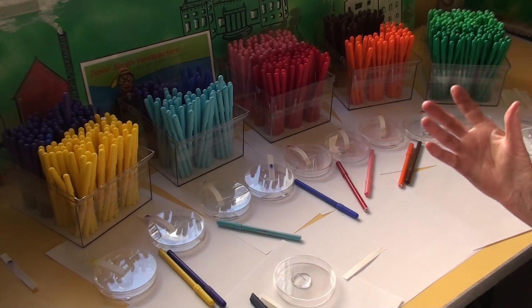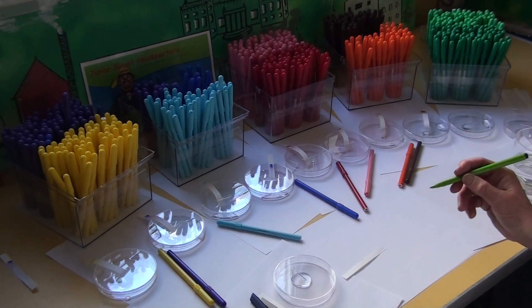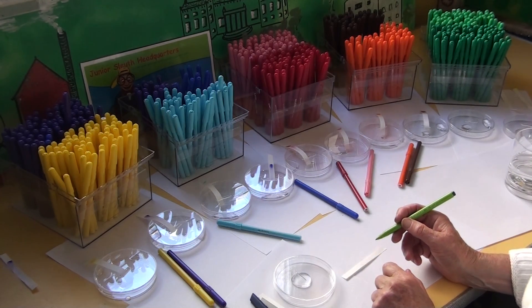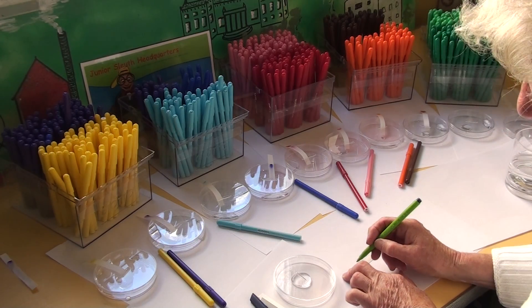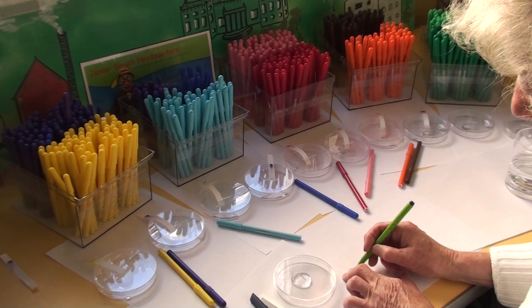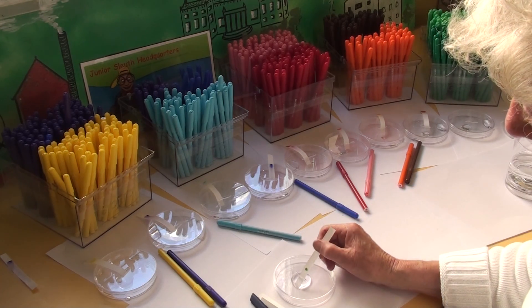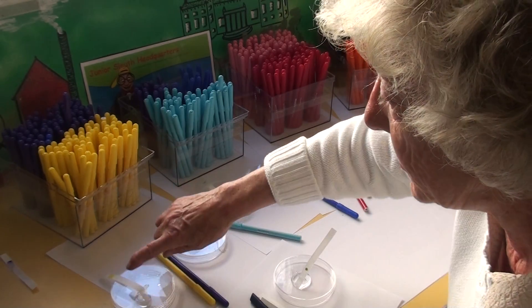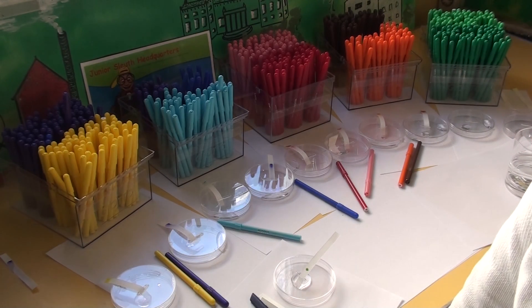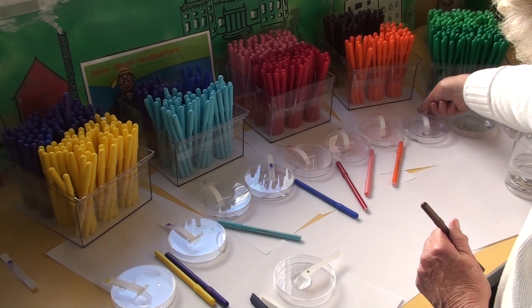Each child gets a strip of chromatography paper. They will have chosen one of the pens, so you divide the class into the light colours and the dark colours and circulate the pens around. Science is always about measuring — you've got to measure where you put the dot on the strip of paper. So you put two of their fingers at the very end of the paper, and where the fingers end, make them do a nice big inky dot. Then you drop the piece of paper into the water and it'll slowly climb up. That was a yellow pen — you let the water climb through the ink.